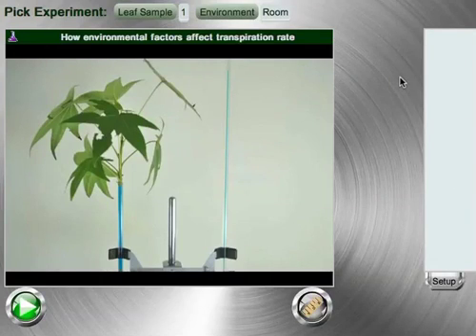Welcome to the Smart Science Lab about plant transpiration. Water in plants evaporates through leaves in a process called transpiration, and you are going to try to discover how different environmental factors affect the rate of this evaporation through the leaves.